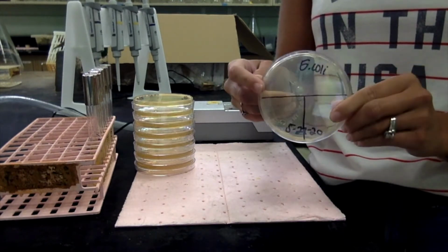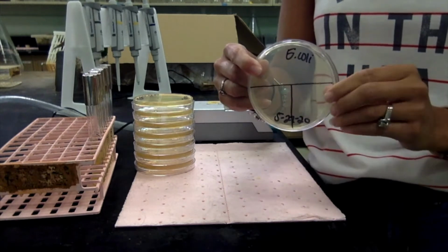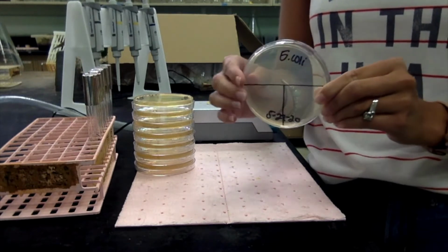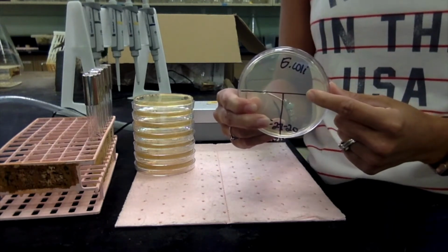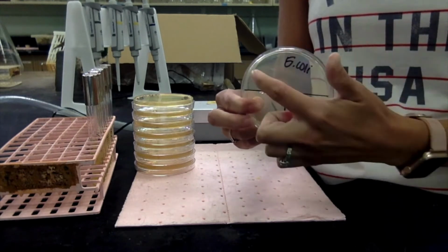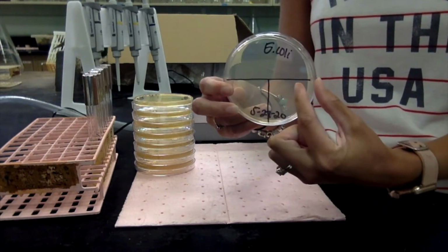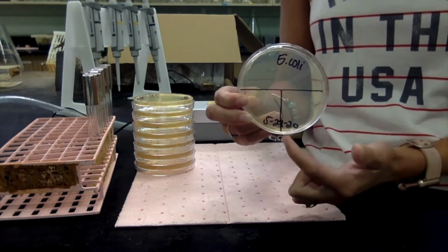You want to label your petri dish. So I've got it labeled what kind of bacteria this is going to be, and then I have a T written on it. I don't write T's on all of mine, but I just wanted to do this because this is how the diagram is done in your book. Basically what you're going to do is put the bacteria in this first quadrant using a loop. Then we're going to flame our loop, drag over a few cells into this second quadrant, flame our loop again, and then drag over the last bit of cells into this third quadrant. The whole point of this is to get an isolated colony.